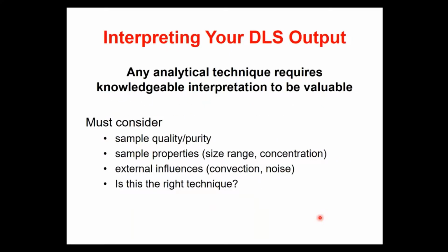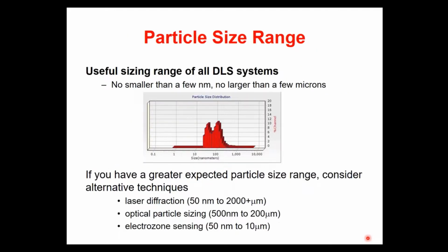All right, so that's the first part of the talk, which I talk mostly about DLS. I want to leave some time for questions, so I'm going to go through these next slides fairly quickly, but I want to encourage all users that you need to be skeptical of your output. Any analytical technique requires your knowledge, your interpretation to be a valuable measurement. So let's consider some of the ways that things can go wrong.